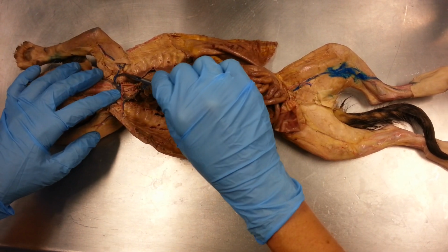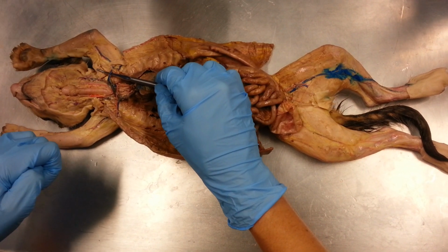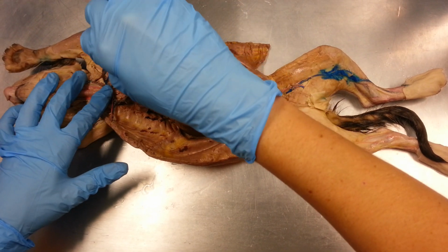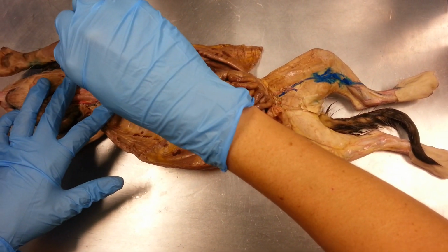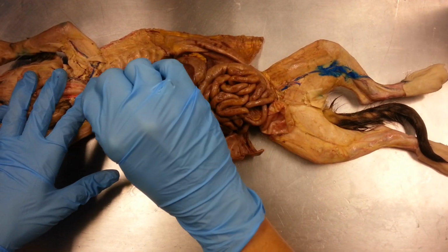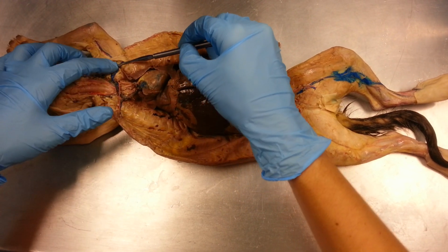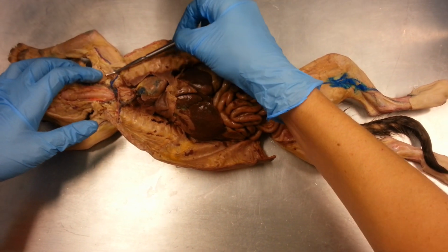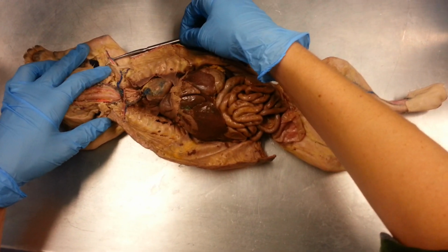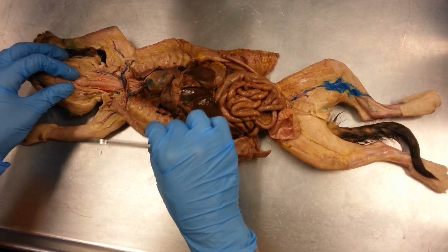Okay, once I get past that rib cage, in my armpit, I have my axillary vein and artery. Okay, you can see here this splitting back deep is subclavian, going to my clavicle. Okay, subclavian, axillary. Once I pass my rib cage or my armpit, this is going to be brachial vein and artery. Okay, simple as that. I can just show you on an undissected arm.